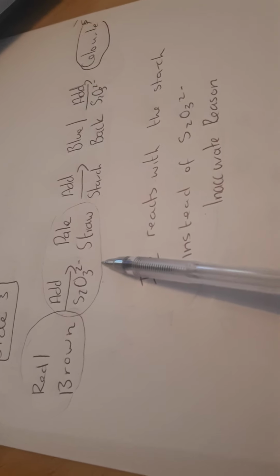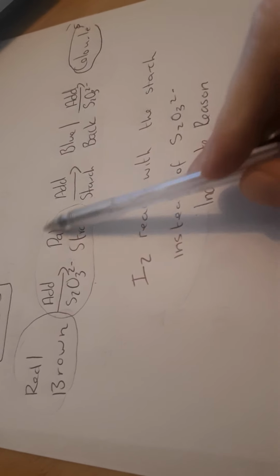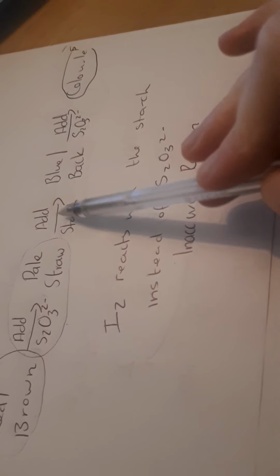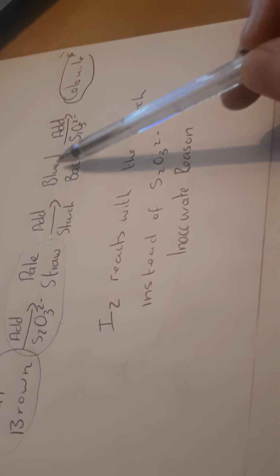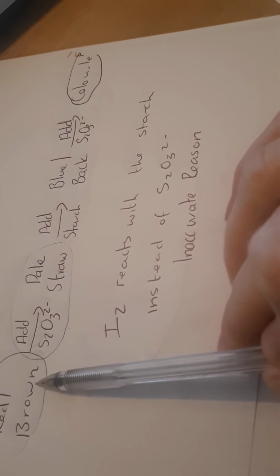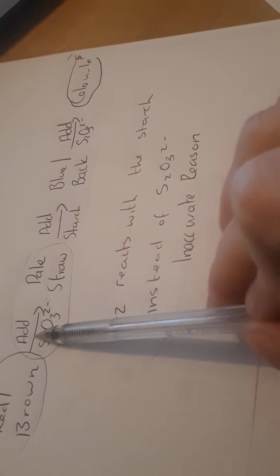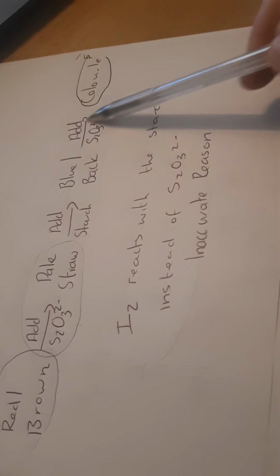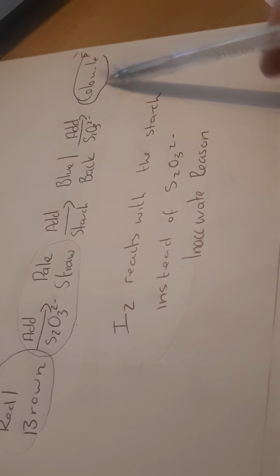So for that reason, I have to titrate some of this sodium thiosulfate to bring it down to this pale straw colour. Then and only then can I add in my starch. Because there is still some iodine present, not as much as at the start because I've titrated a bit of it already, it'll turn blue-black, and then I continue to add until it turns to colourless.